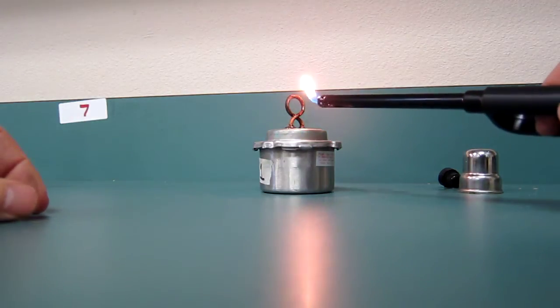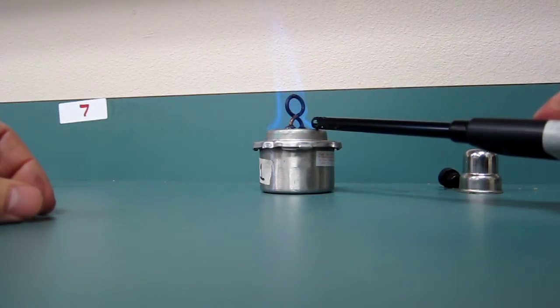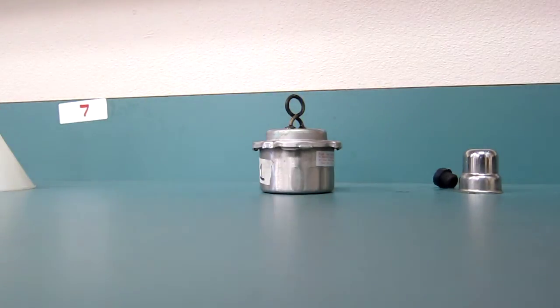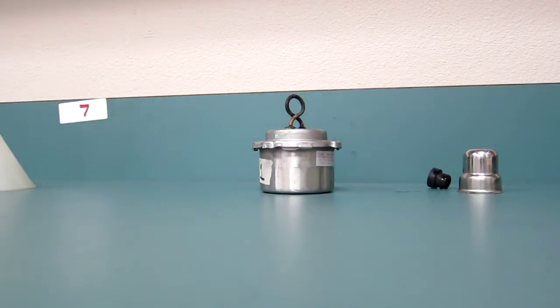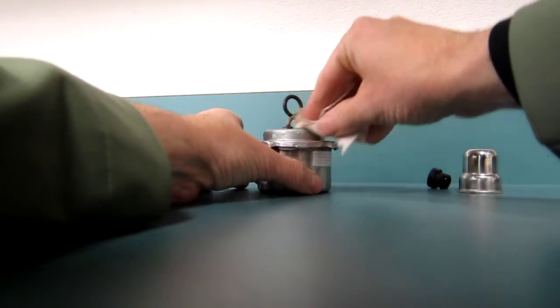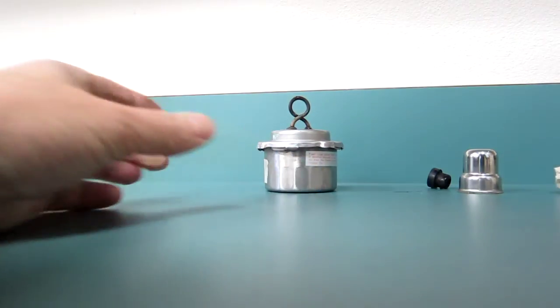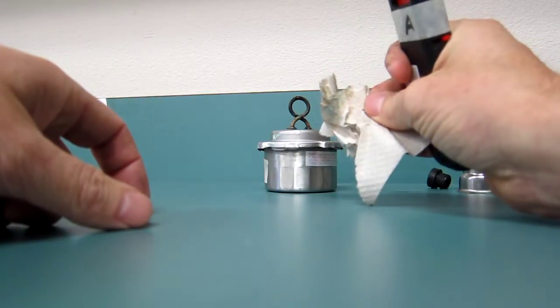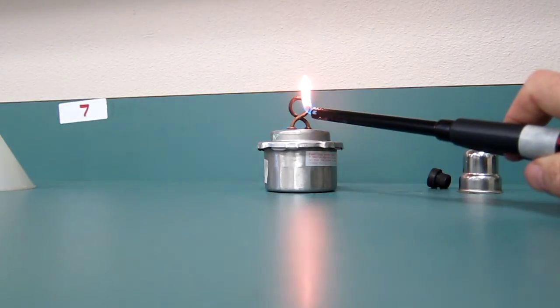Light it. Technically you can just hold it here and it will light. This one had alcohol at the base, and so it's burning from the bottom and it's burning too high. So I'm actually gonna blow that out, okay? And I may even have to wipe up some of this alcohol down here. And you just make sure it's not too hot. Wipe that alcohol off. It sometimes gets a little extra when you put the lid on the first time. Make sure you get this out of the way completely. Now it has alcohol on it and it's highly flammable. So you can throw that in the trash and then come back and relight it.